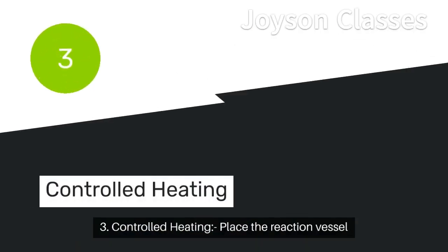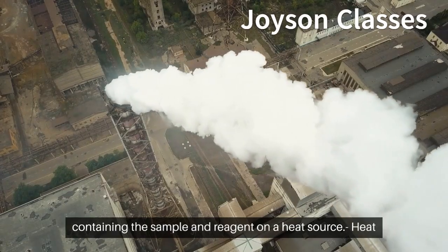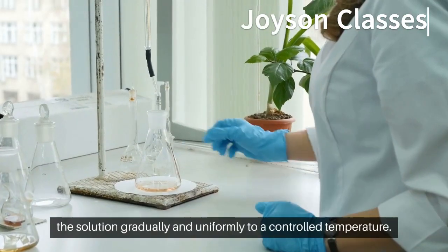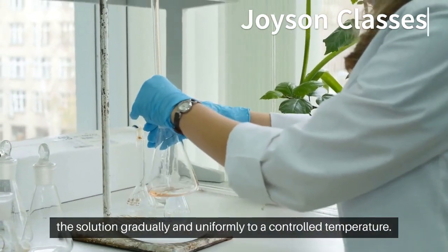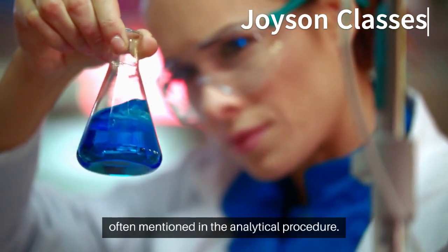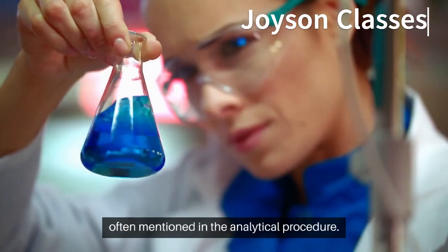3. Controlled heating. Place the reaction vessel containing the sample and reagent on a heat source. Heat the solution gradually and uniformly to a controlled temperature. The temperature chosen is specific to the reaction and is often mentioned in the analytical procedure.